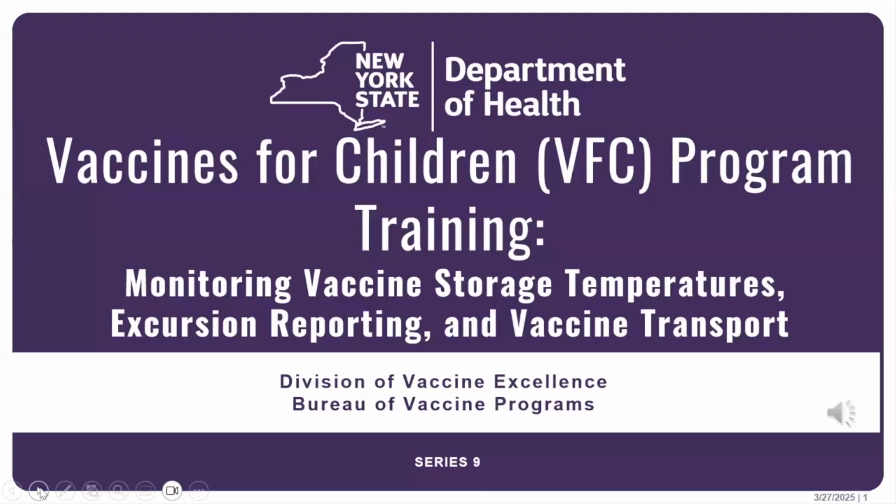Welcome back. This next training is intended to provide guidance to New York State VFC providers on monitoring vaccine storage temperatures, reporting temperature excursions, and vaccine transport.